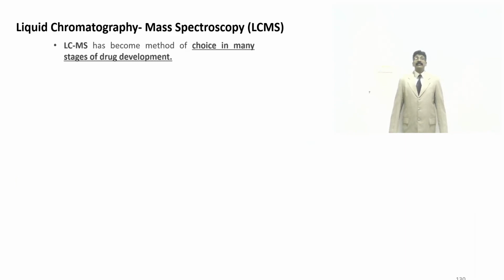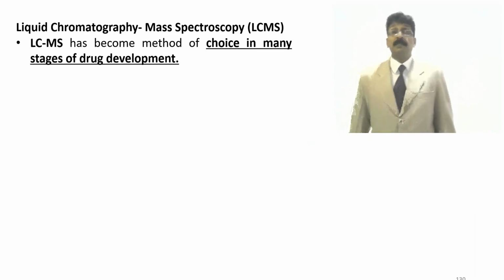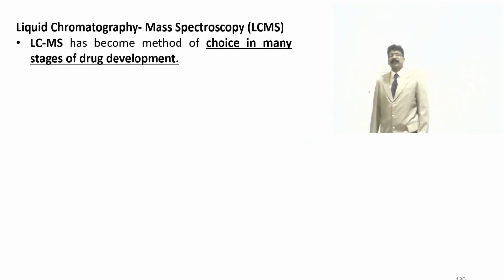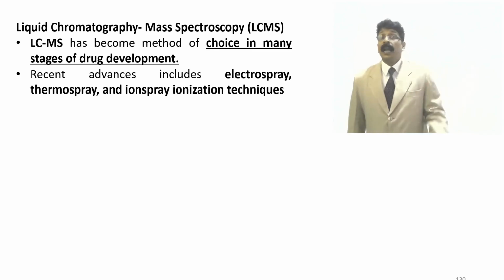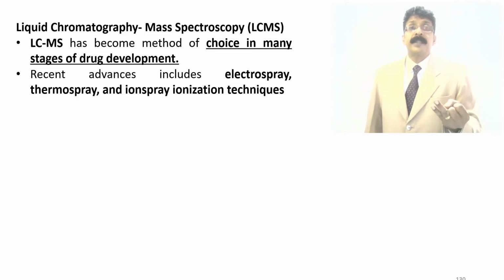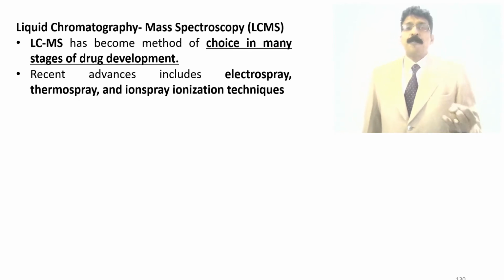And this is the information about the application of liquid chromatography connected with mass spectroscopy. This hyphenated technique becomes the method of choice for many stages of drug development. Recent advanced techniques include electrospray, thermospray, and ion spray ionization techniques.